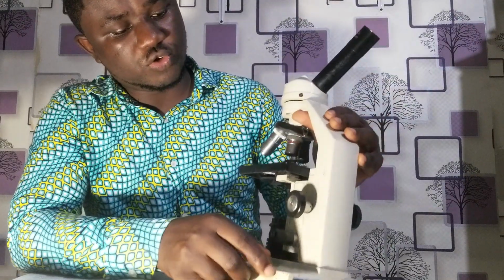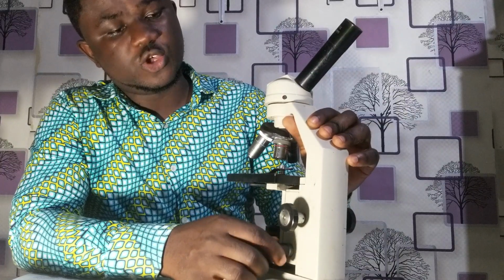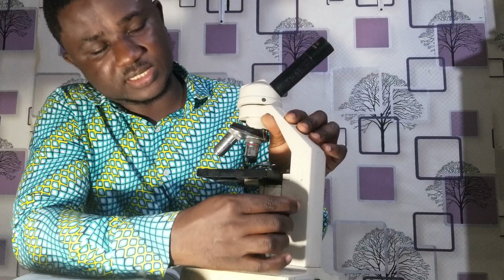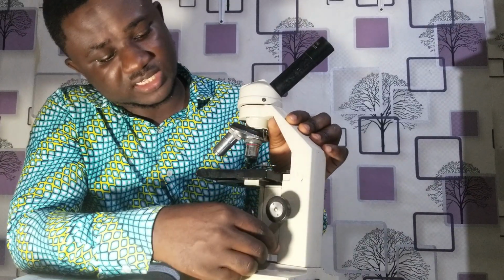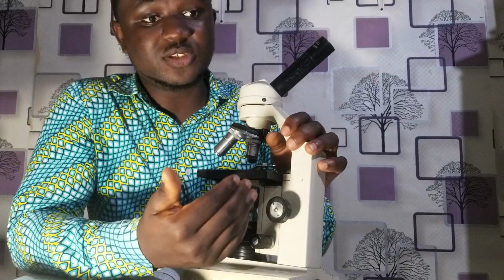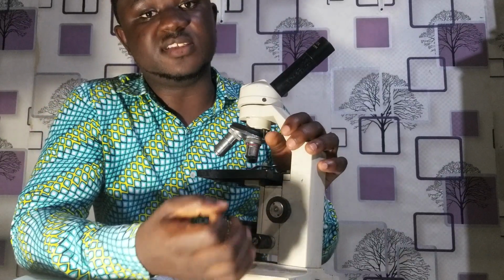And you should also know the various forms of adjustments. So this is the fine adjustment knob for this microscope, and then this is the rough adjustment. They are mostly used for focusing the microscope, and most modern microscopes have a different design from what I have here. And so let's continue.